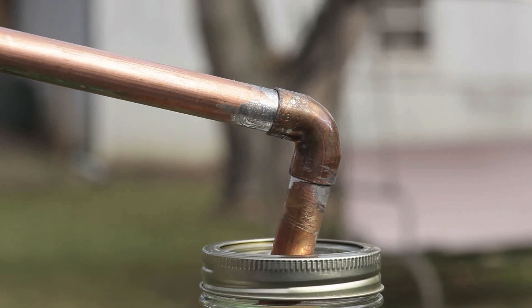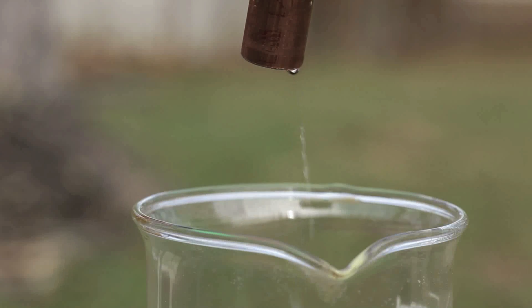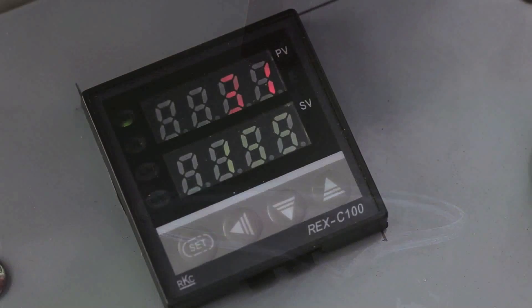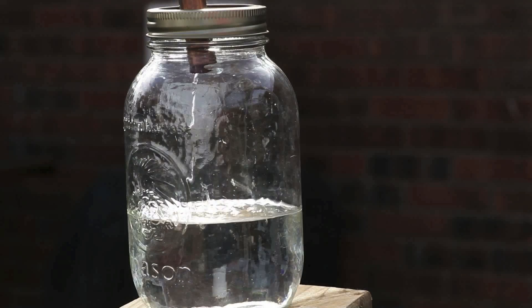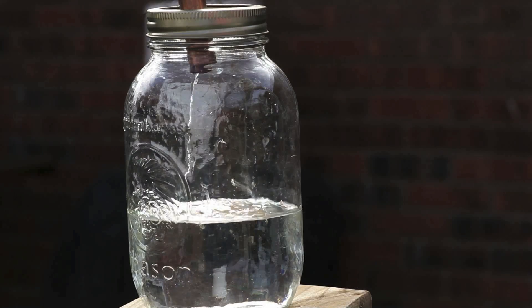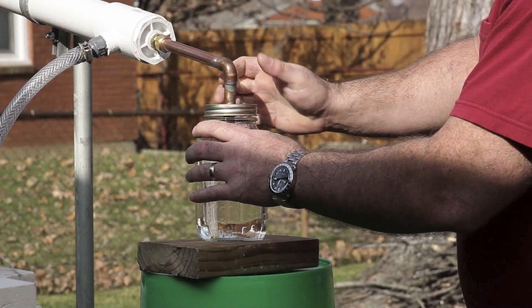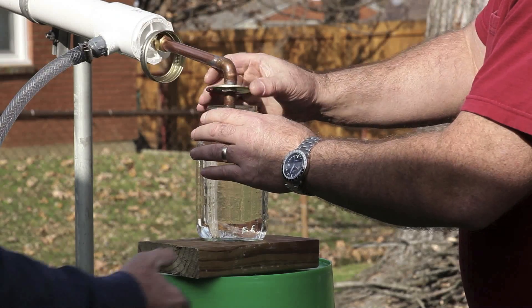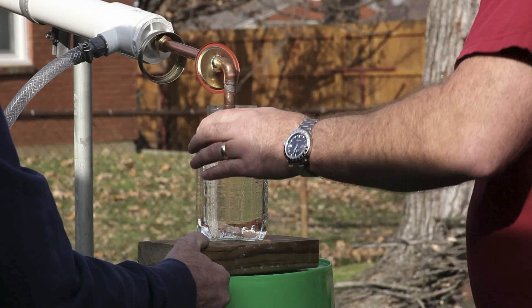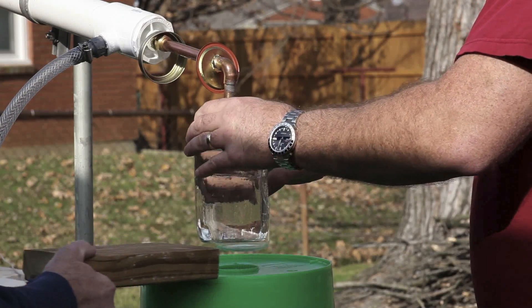These fumes that you see mostly are butane that's dissolved in the gasoline. Temperature is up at 31 degrees now and it's flowing pretty good. The first drops came off at 23 degrees Celsius. Now here I am taking off fraction number two — fraction number two came off at 96 degrees Celsius.